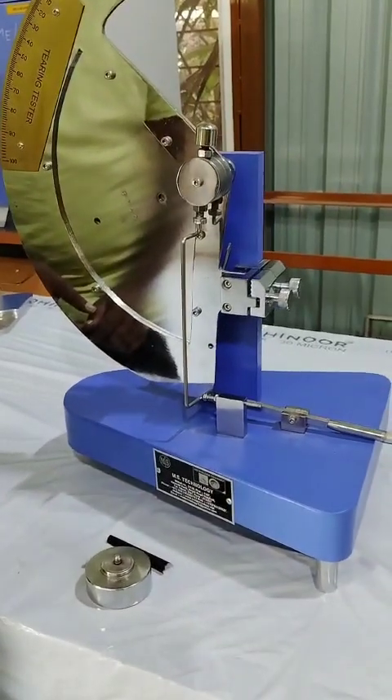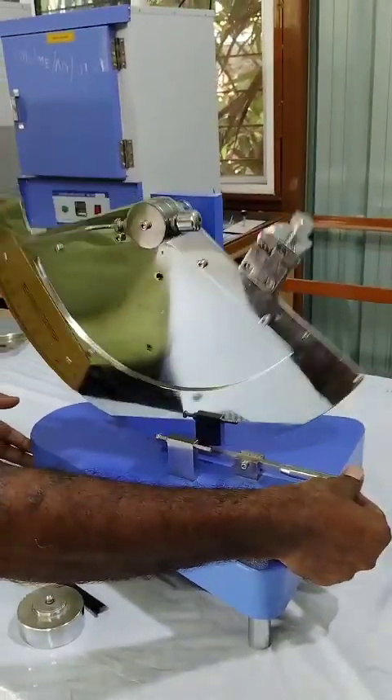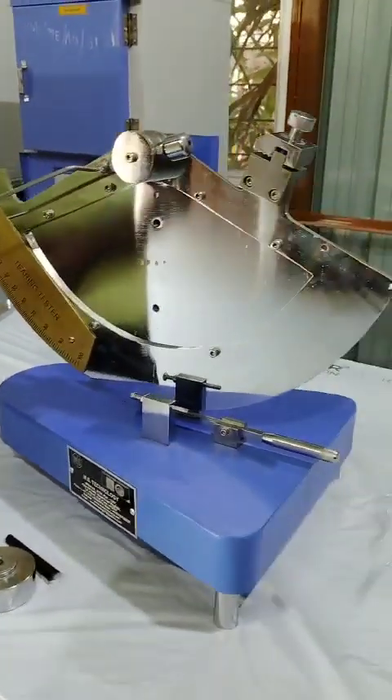This is how it will look like. After that, release the pendulum and check the pointer — it should be at zero. Here you can see it is near about at zero.